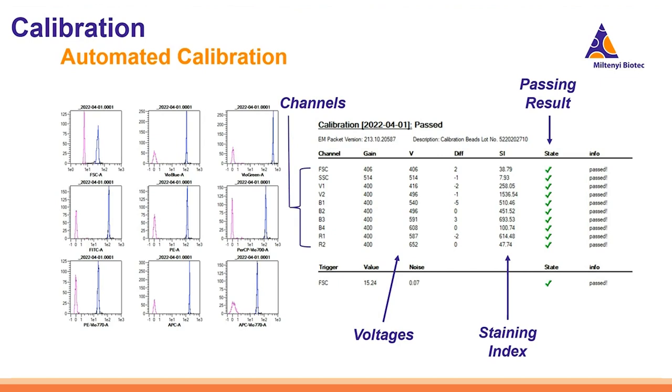And you want some sort of daily calibration to verify that everything is functioning, because you don't want to see something weird in your data and then have to backtrack to see, oh, my machine wasn't actually fit for use, and that's why my data looks weird.